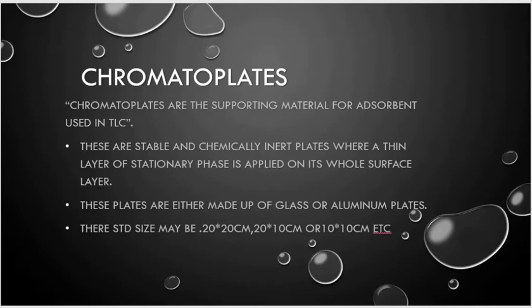20 into 20 centimeter, 20 into 10 centimeter, or 10 into 10 centimeter. It may be 10 into 5 centimeter, etc. But these are the standard sizes of chromatoplates.